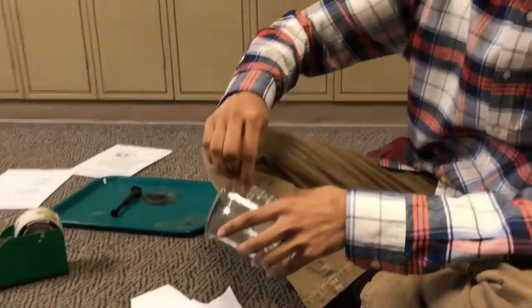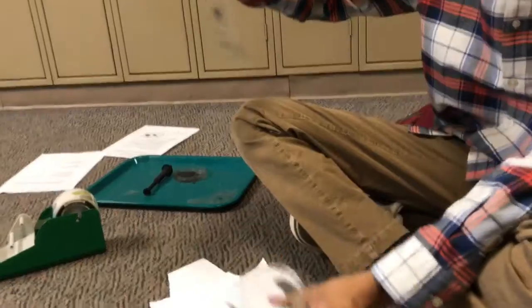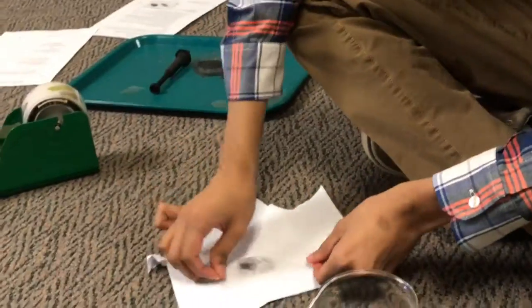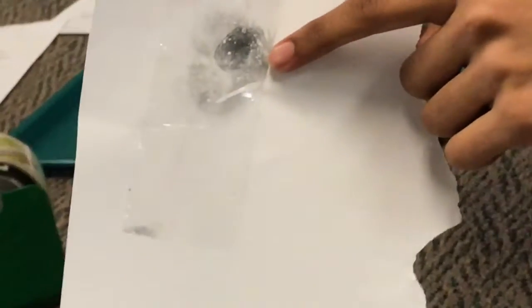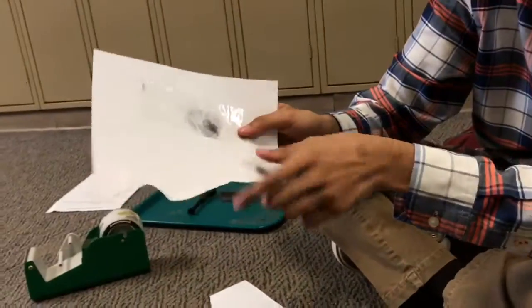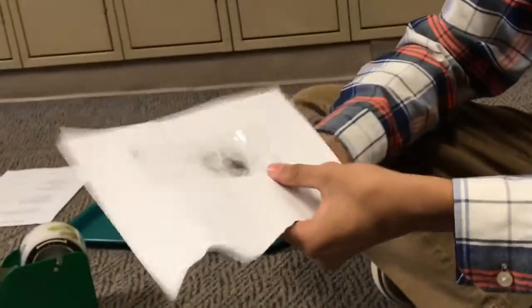And you want to rip one side to the other side slowly but surely, and boom. Look at that. You got yourself a latent print right there. Nice. Looks good. You want to try to see the minutiae and the details, and you want to make sure it's clear. And you always want to put it on a white piece of paper so the black stands out. There you go.